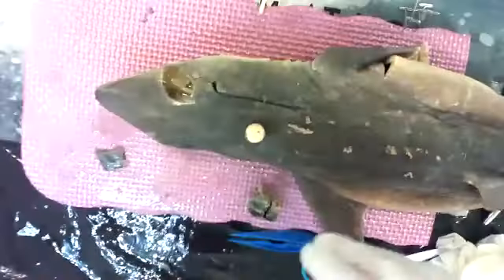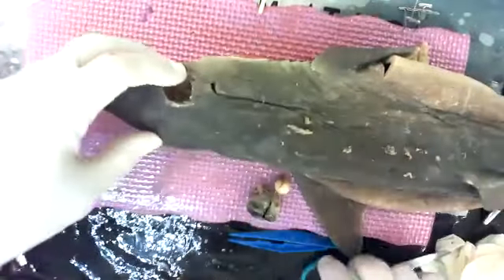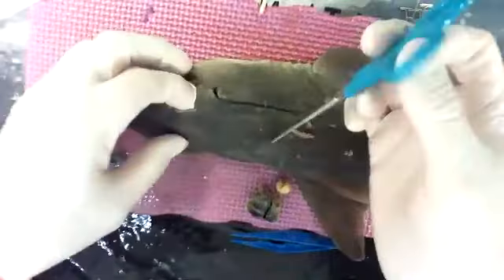All right, that's the eyeball. The last thing you can do is brain. And we're technically out of time, so I'll just show you how to get to the brain, and I'll let you do it if you want to, but then I'll show you how to clean up. You can clean up on your own, but you don't have to clean up right now. In fact, you can wrap it up and store it for later if you want.